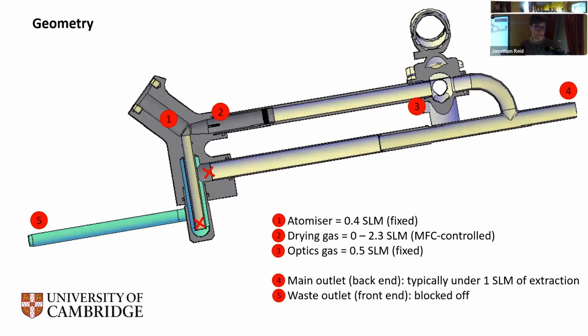This is what the machine actually looks like. The atomizer sits here in number one. Then it can split the excess droplets, the stuff that basically collides because it's too big, gets taken out through particle impingement and goes into this reservoir that has a P-trap. This P-trap is filled with liquid, so no gas escapes. The gas is forced through here. This is actually another gas injector. So this is some secondary drying gas that really lowers the RH down to promote drying.